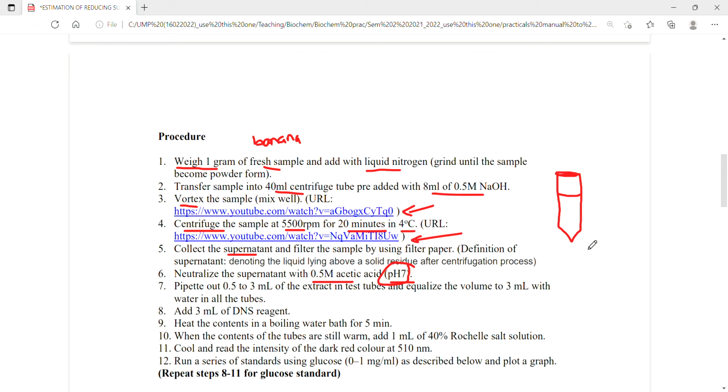Okay, so that's done, and then you are to take this one, assuming thankfully you got some 4 ml finally. So they want you to take into different, say, test tubes. Say 3. Say you take 0.5 ml, 1 ml, say another one 2 ml.